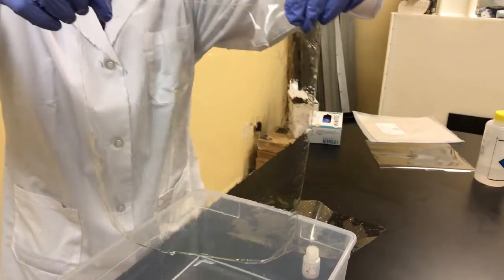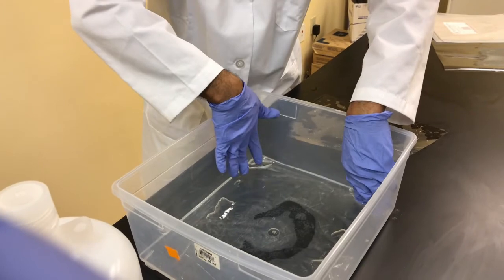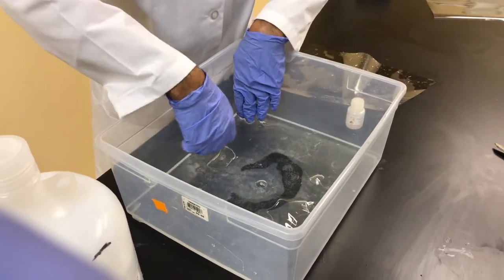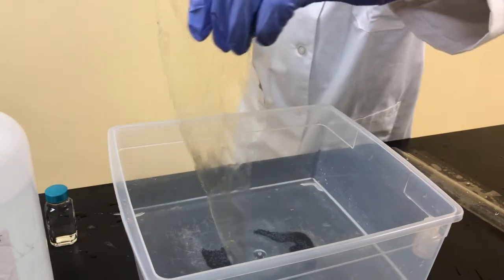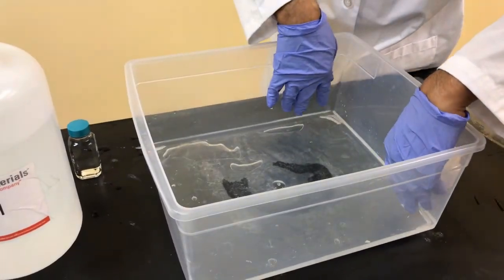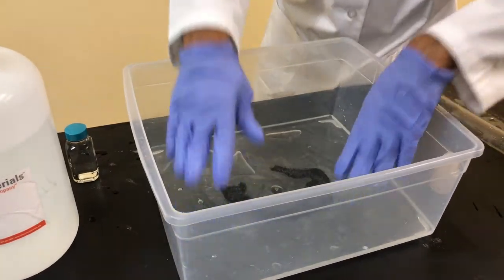Now we're simply going to place the membrane back into the KOH bath for at least 24 hours. You need to immerse it in one molar of KOH for at least 24 hours after it's removed from the liner. We're just placing it in the bath for the 24 hours where it'll sit there until we're ready to use it for applications in the electrolyzer.